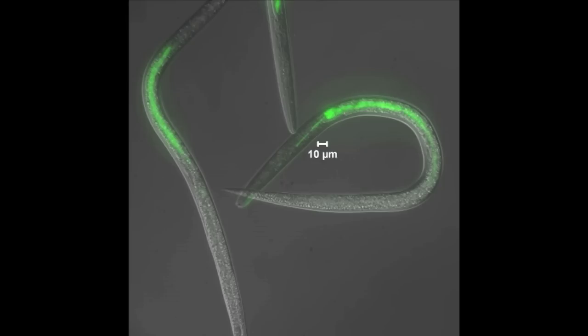What does this mean? This means that the nematode on top is not actively regurgitating, while the nematode on the bottom, on the right-hand side of your screen, is actually regurgitating.